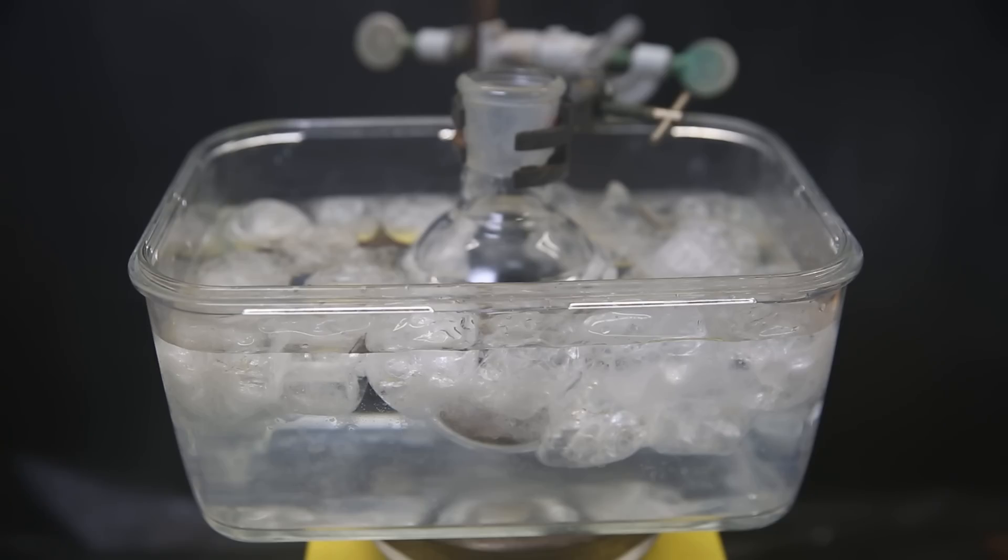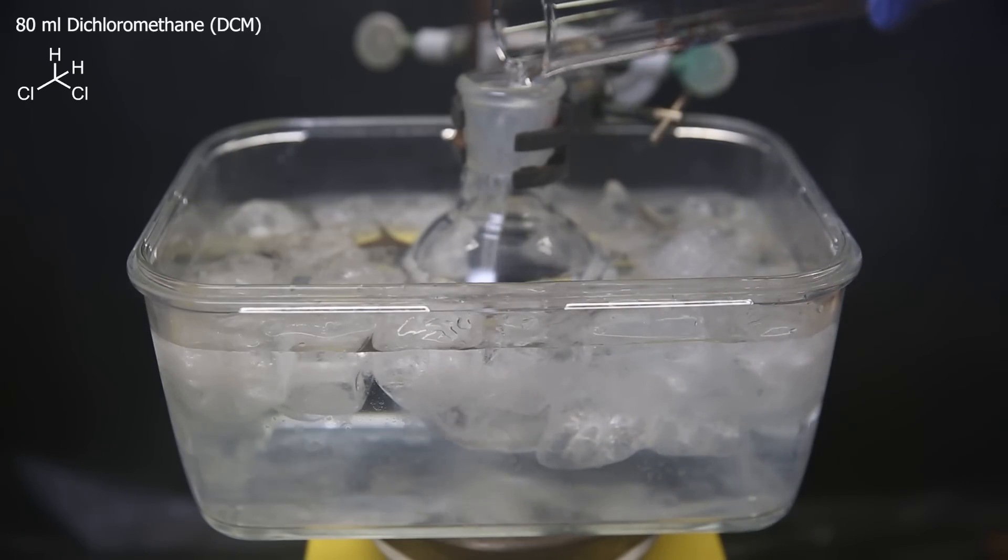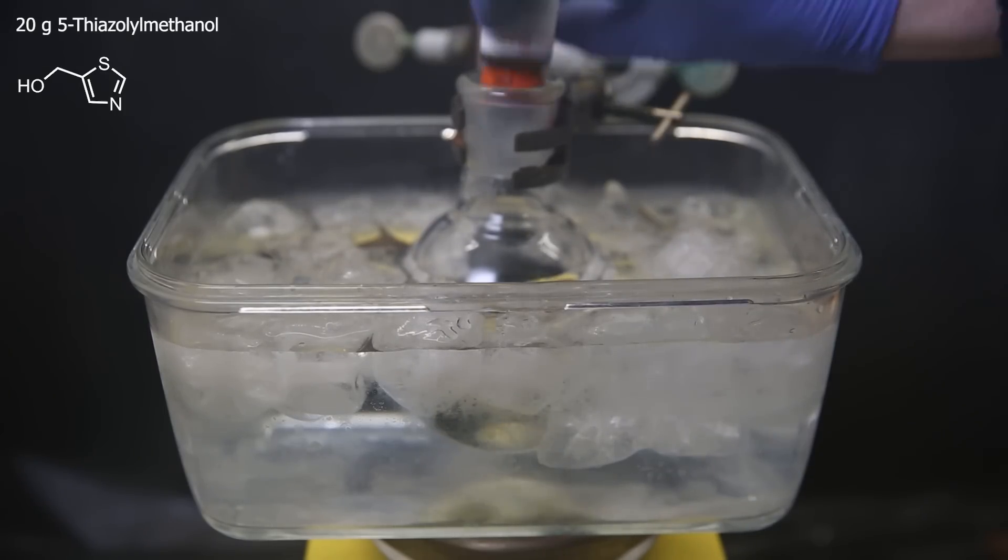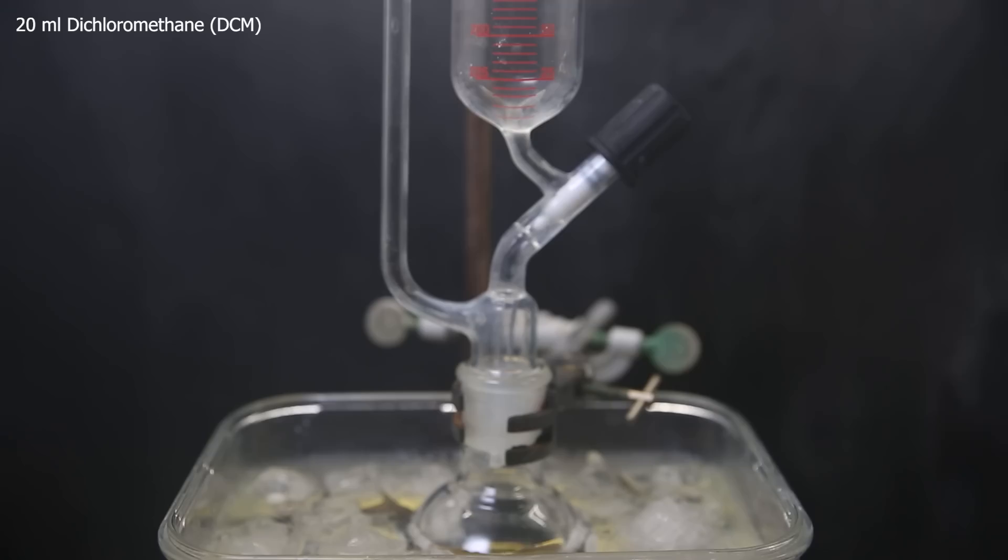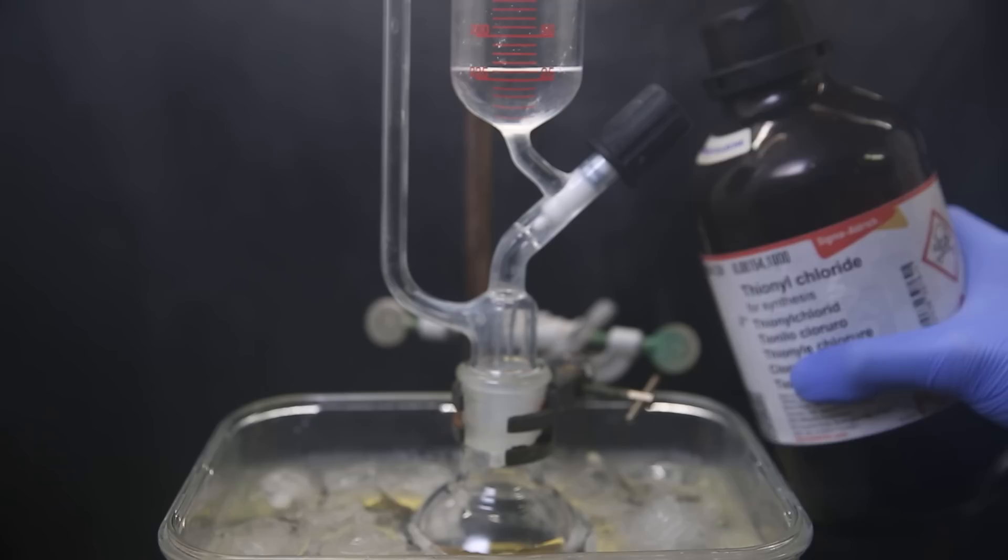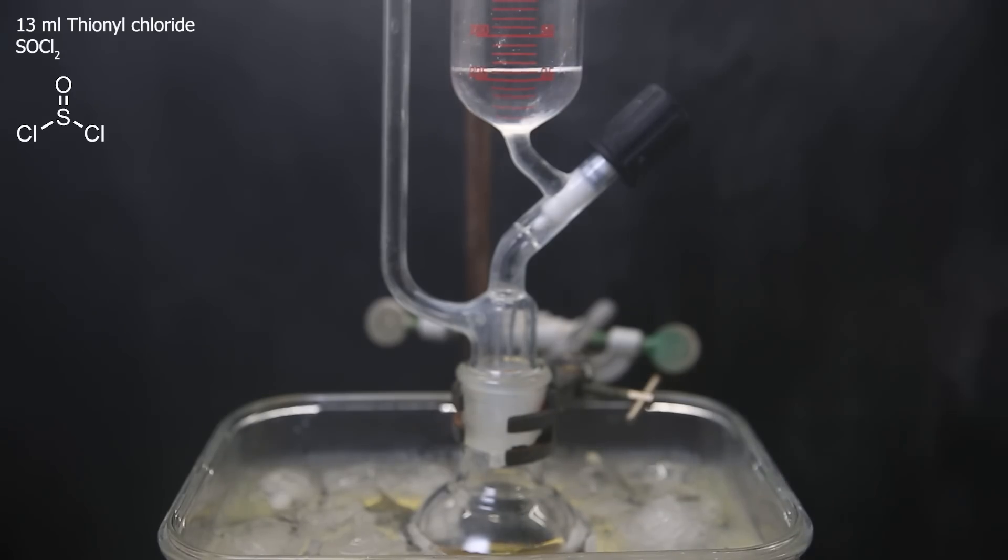For that, I set up a new flask in an ice bath and first add in 80 mls of dichloromethane as a solvent. I then pour in 20 grams of this thiazol reagent, which are two full small bottles. I attach a dropping funnel in which I first add 20 mls of dichloromethane as a diluent, and then it is time to whip out the big bottle of thionyl chloride, of which I add a humble 13 mls into the dropping funnel.